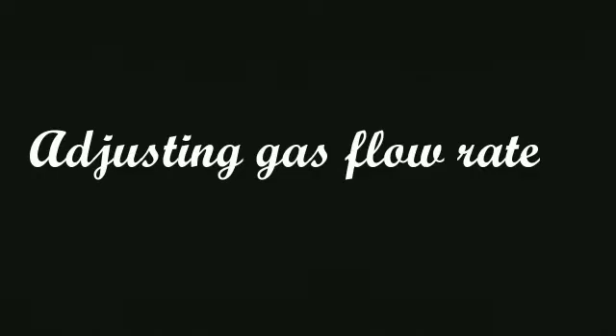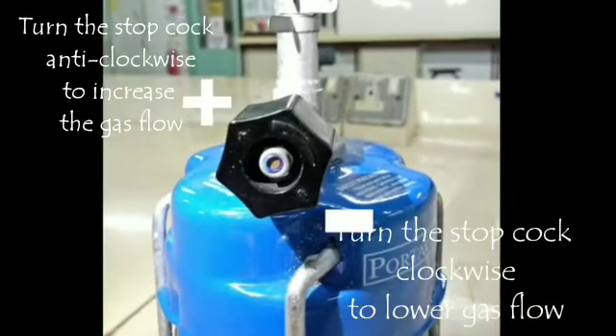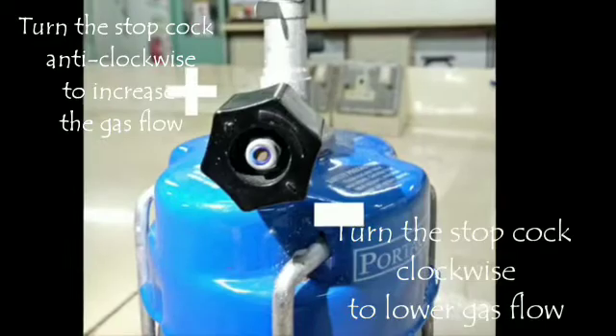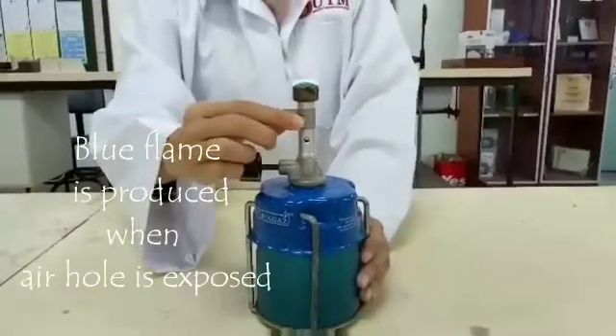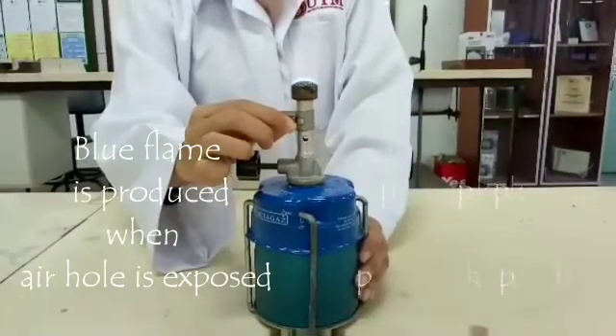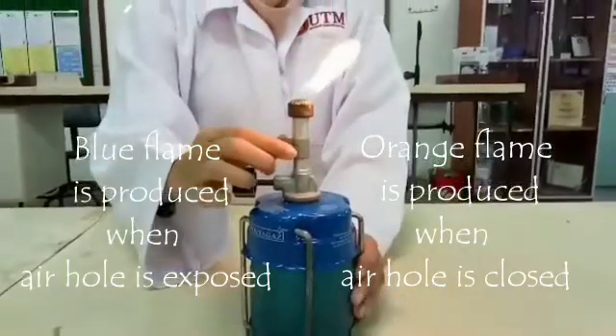Adjusting the gas flow rate. Turn the stopcock anti-clockwise to increase gas flow, and clockwise to lower gas flow. A blue flame is produced when the air hole is exposed, while an orange flame is produced when the air hole is closed.